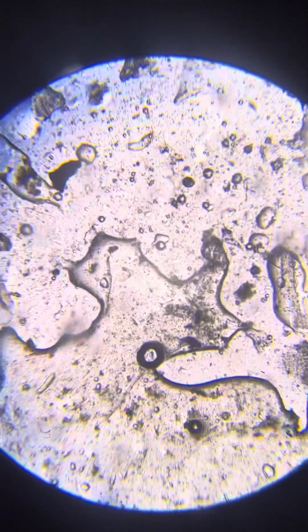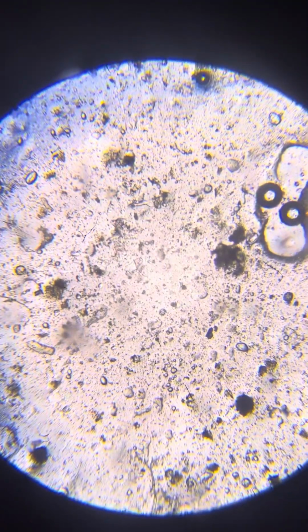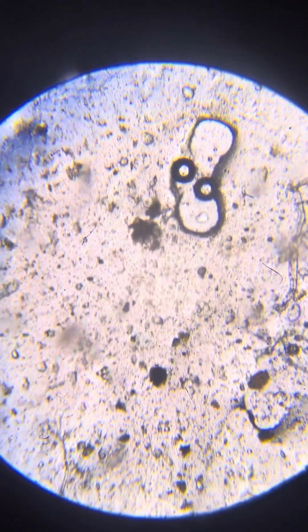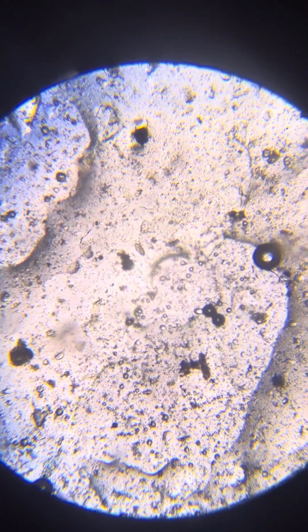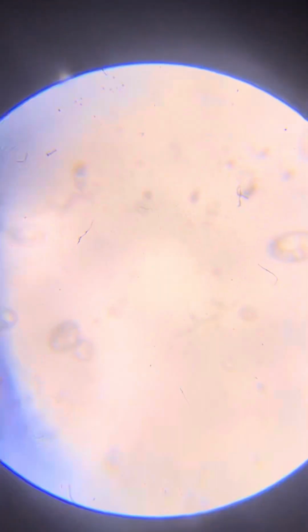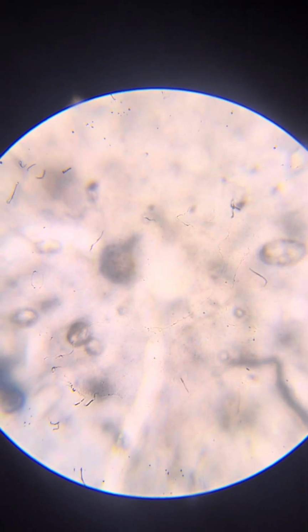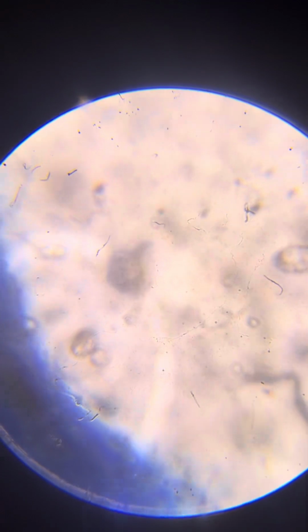So this is the third slide. And these two Neros look like a comical face. It's time to focus here and to zoom in. Maybe there will be less of a problem with the focus. No, still have problems. I really need to know the whole mechanics of the microscope.